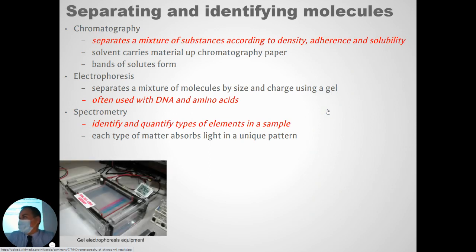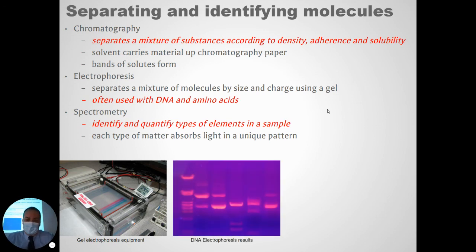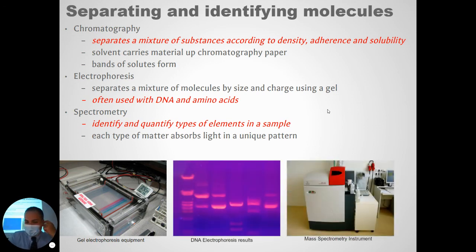You could also do it using DNA, the same kind of process, although you use electricity to do it, where you put samples of DNA in a gel, apply electricity, and the DNA moves, but separates out according to the different size of those DNA molecules. And you end up with results that look like this. We'll talk more about that as we get to our DNA unit.